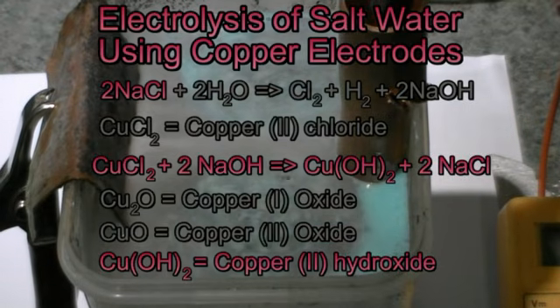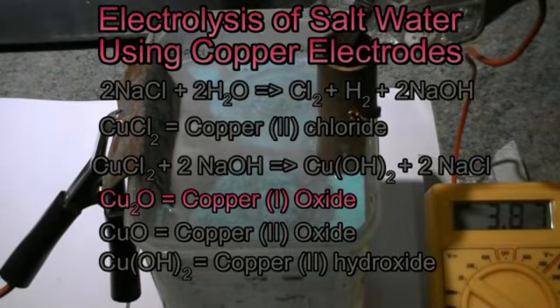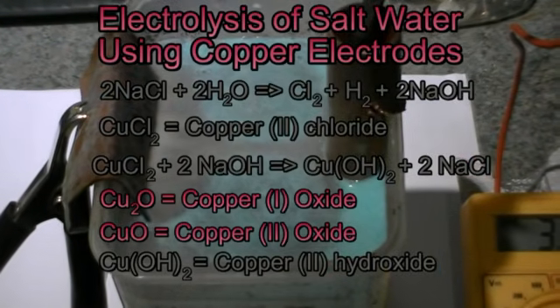reform sodium chloride salt. Another possibility is that the copper anode may also react with oxygen to form copper(I) oxide or copper(II) oxide, the difference being the oxidation state of the copper being 1+ or 2+.